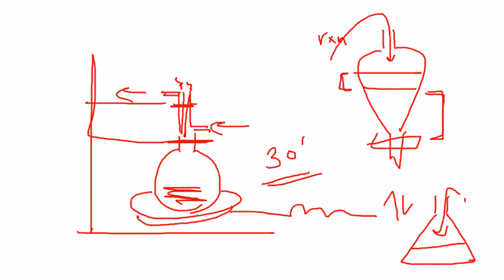And to that you're going to add approximately 1 gram of calcium chloride. You can, if you want to, use sodium sulfate. Those are other choices. You can even use magnesium sulfate for that matter. The whole idea is to use it as a desiccant and basically get rid of any moisture. At this point of time, I would say 60% of the class gets a relatively pure material, and they don't need to carry out the second distillation.